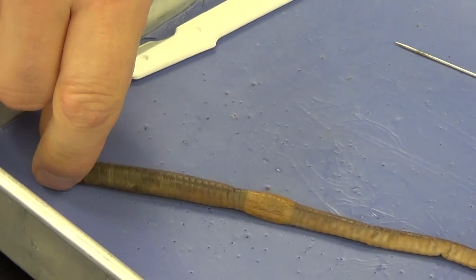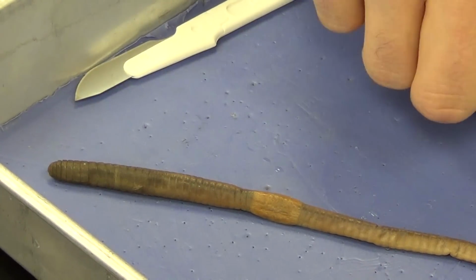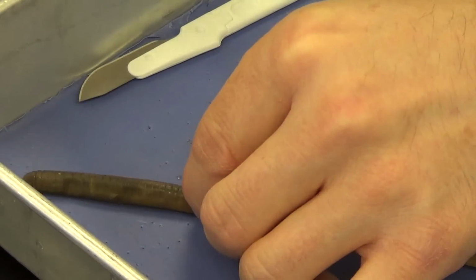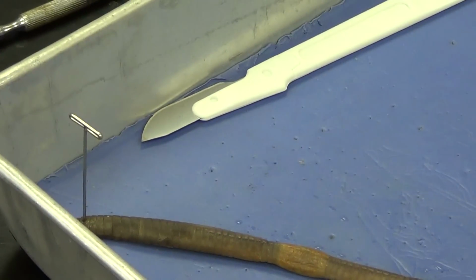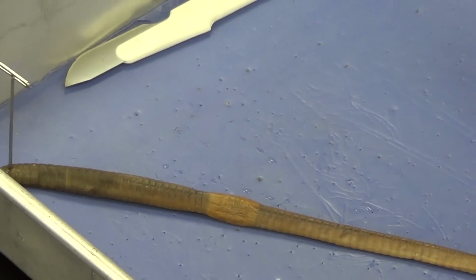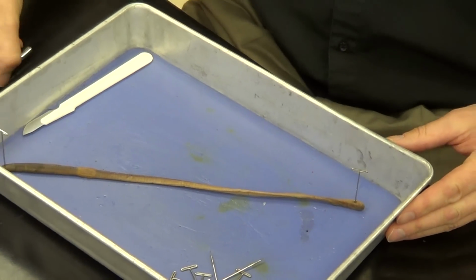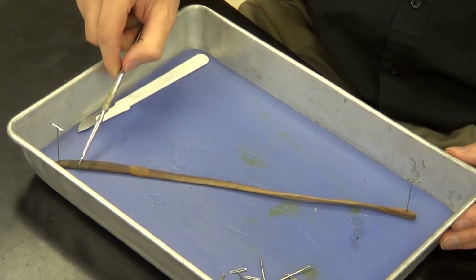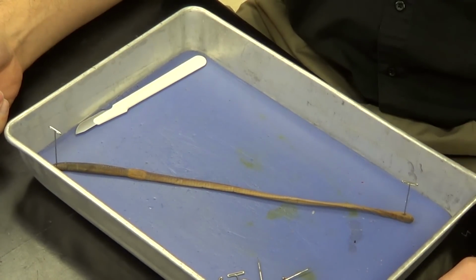And we have to put the dark side up. Now, the dark side is very pigmented, and that is the side that needs to be up in order to see the organs. So I'm going to go ahead and put a pin straight in the anterior aspect of that earthworm, and then I'm going to take another pin and put it straight in the posterior aspect of the earthworm, just like that. And again, we want the dark side up. This is the dorsal side of the earthworm. The underside, or belly portion of the earthworm, is the ventral side of the earthworm.